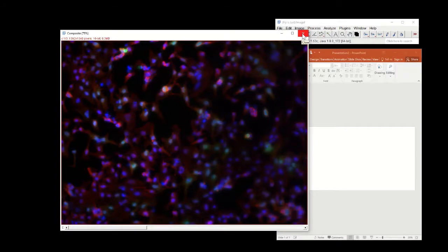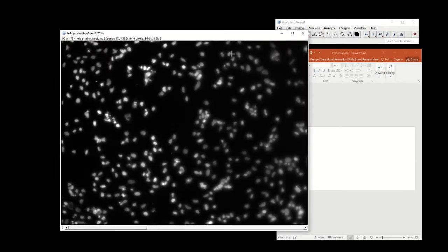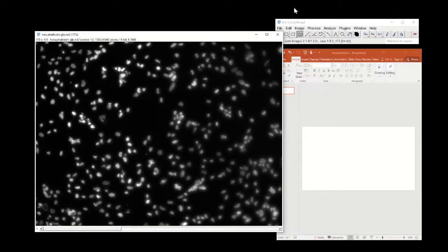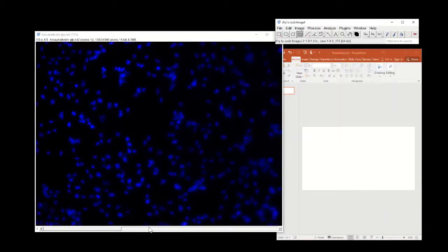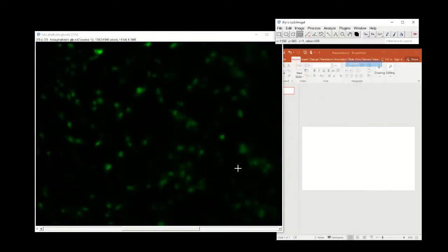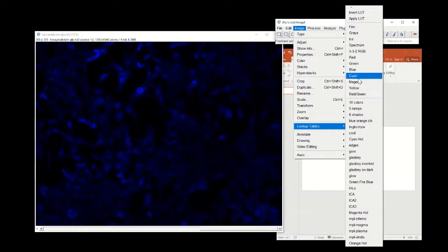So let me close this file. Let me reopen this one. Okay, and now I'm going to split them into 3 independent channels. But before I do it, I'll just associate some color with them, sorry. So lookup table, this is going to be my blue channel. This is going to be my green channel, and this is going to be my red channel. Sorry, right down here. Now I'm going to split it.